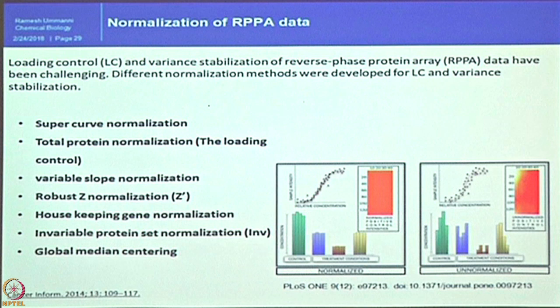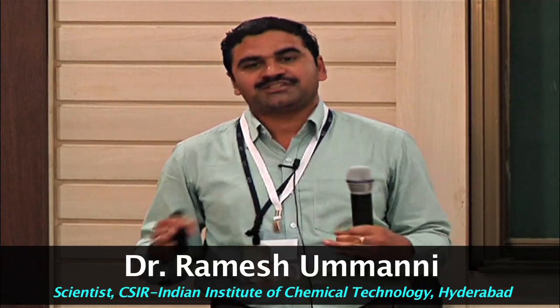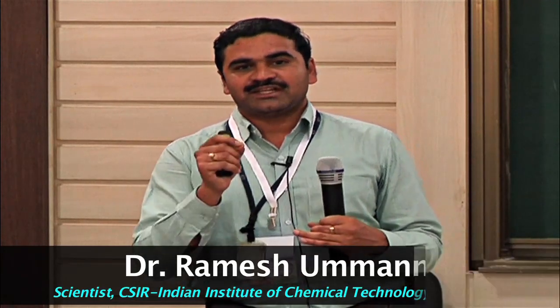So, different normalization methods were developed for LC, that means loading control, and variance stabilization. Among them are super curve normalization, total protein normalization, variable slope normalization, and robust Z score normalization methods. One method we follow in Western blot is housekeeping normalization. We are all fond of probing GAPDH more than the target proteins very often. Then there is the invariable protein set normalization, which means that in all the 1000 samples, we know that one particular protein concentration will not change. So, that will be set as a landmark.